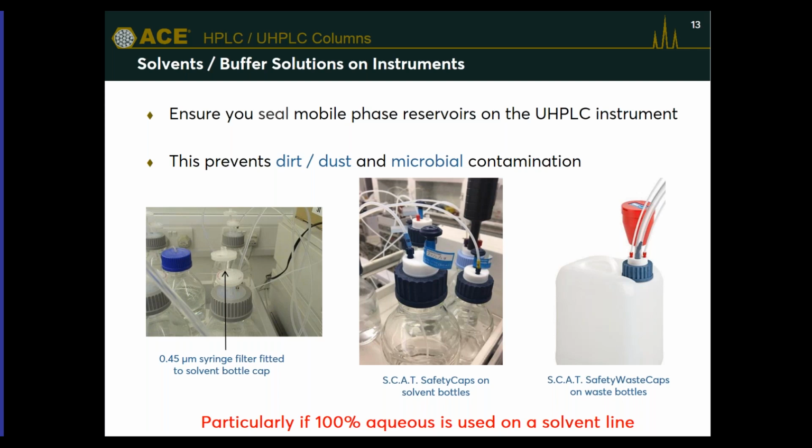And you can see there as well, it's always good practice to use solvent cap systems on waste containers as well to reduce the likelihood of volatiles in the laboratory.